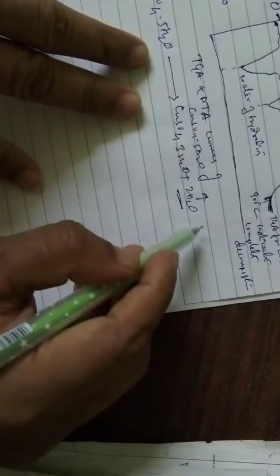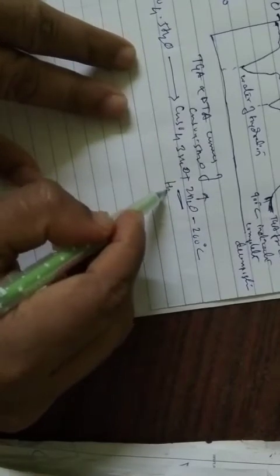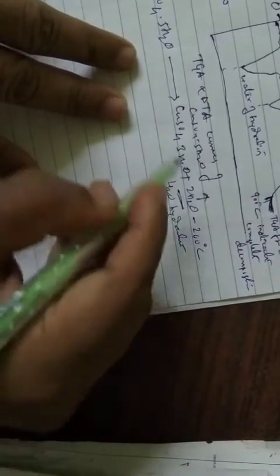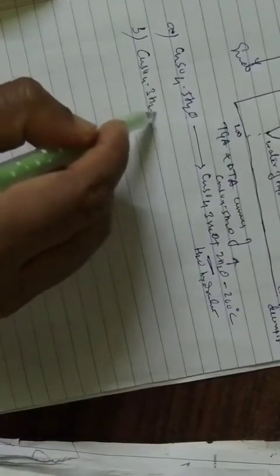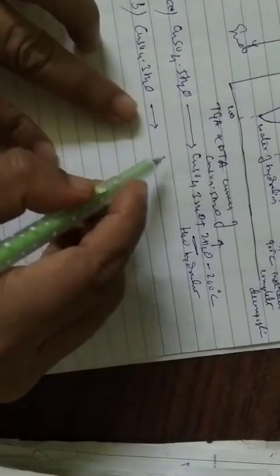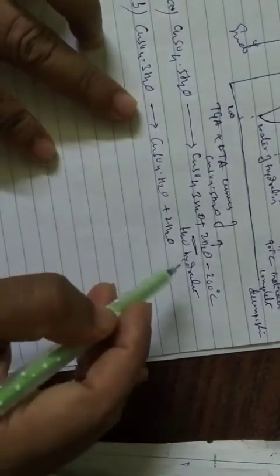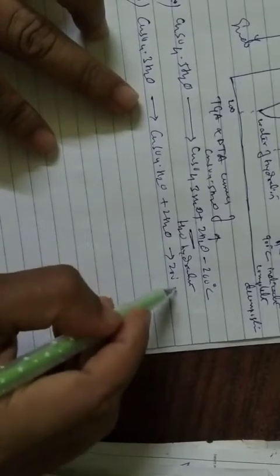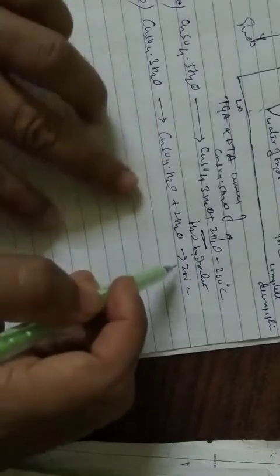So here, at around 200 degrees centigrade, this is called the water of hydration, okay. So this is around 200 degrees. So you can see that the peak is going to appear, and this is because of this reaction. And the second, you can see here, whatever copper sulfate 3H2O remained, further gets decomposed into copper sulfate monohydrate plus 2H2O, which is going to happen above 200 degrees centigrade, okay. As you increase above 200 centigrade, you are going to see this near about 200.